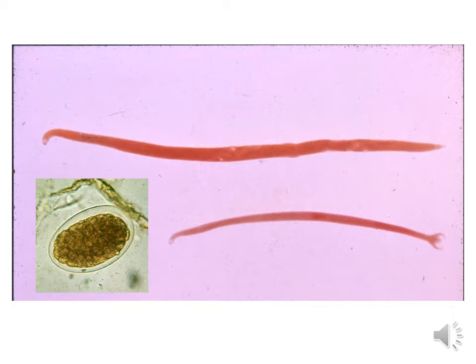If you look at the male to your right, it has a sort of umbrella tail. It is not curved, but inflated into an umbrella structure. Some chitinized structures are connected together with a very thin membrane, so they have the shape of an umbrella. And people say it is usually used during copulation. The male holds the female by this copulatory bursa. It is called the copulatory bursa.